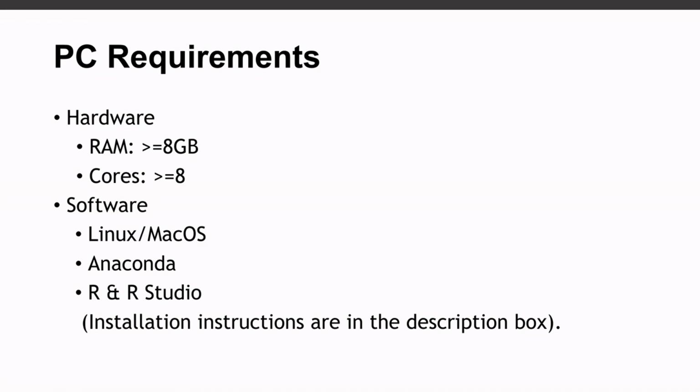In addition, you should have R and RStudio installed. We are going to use R to generate some plots. In other words, we are going to use R to visualize the statistics results that we will obtain. I have tutorials that show how to install R and RStudio. In those tutorials, I show how to set up R and RStudio in Linux and Mac OS environments. So check the description box and you'll find the links to those videos.